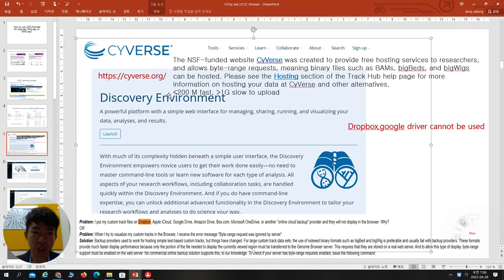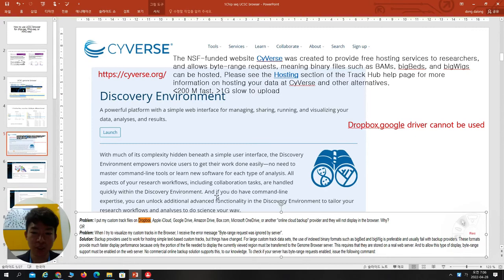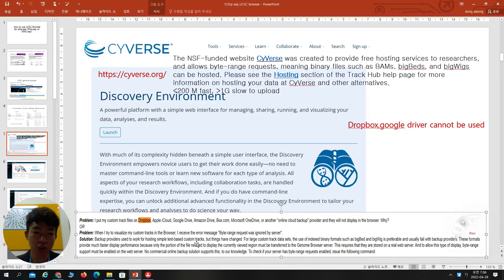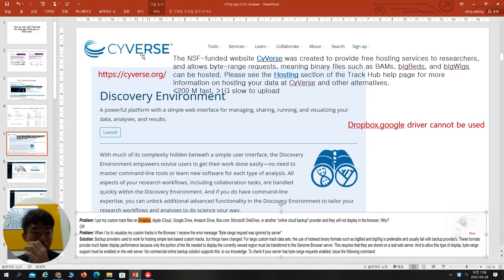You can visit this website and upload your files. Like many people, there are questions about why using Dropbox, iCloud, Google Drive, or Amazon doesn't display in the UCSC browser. The solution is that you have to use byte-range requests. These backup providers used to work for hosting simple text-based custom tracks, but things have changed. You cannot use commercial ones — only Cybers, or something that supports byte-range requests.